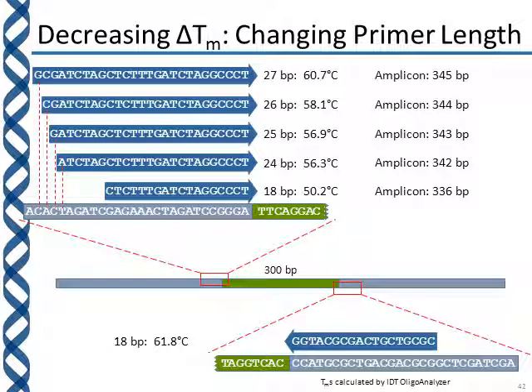In this particular example case, that's not too much of an option because the primer length is 18 base pairs, so it's already a little bit on the short side. I wouldn't want to go much further short than that. You could potentially lower this to 17 or 16 nucleotides in length, but doing that potentially means that you could result in non-specific amplification because the primer could bind to other locations, and so that's sort of the offset. It's kind of that juggling act that I talked about between the various parameters.